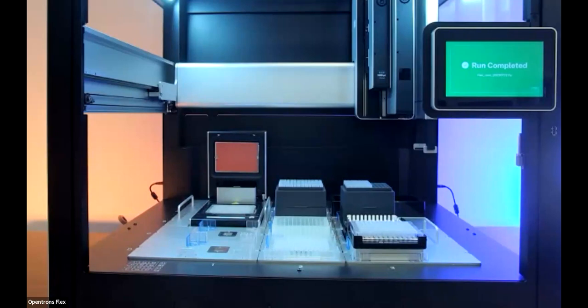Awesome. Does the gripper work with semi-skirted plates? So we have a labware library and we work to bring labware into our ecosystem that we have verified with our internal science team as being performant. Semi-skirted plates is something we're investigating, but we don't have any current dedicated plates like this that are confirmed to work with the gripper. Obviously, you can create custom labware definitions. That's part of our system, being open to new things. But that would be your responsibility to do.